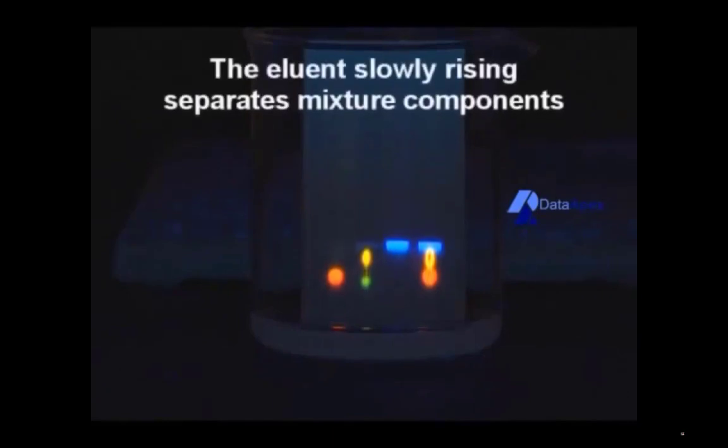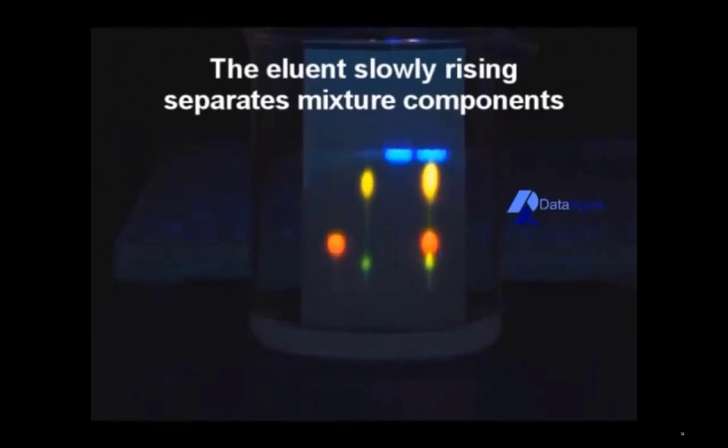Detection is live, right? We just need the ultraviolet system through which we can carry out the separation. Here you can see the sample molecules rising, which are fluorescent, and the fluorescence is produced in the presence of UV light. In this way, UV fluorescent components can be easily isolated.